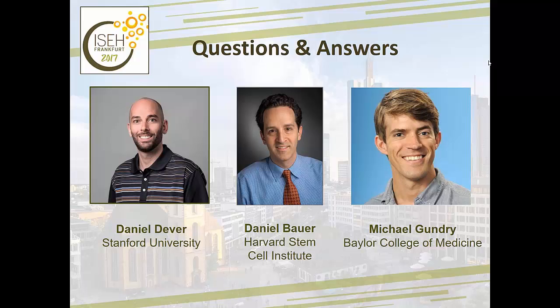And I guess I can start us off quickly with a question to Dr. Bauer, actually. You mentioned that you get a mixture of products for every single guide, and I was wondering, in terms of the perspective of designing an extended experiment like a pooled screen, how do you take those mixtures of editing products into account? What are some considerations that a person could be thinking about?